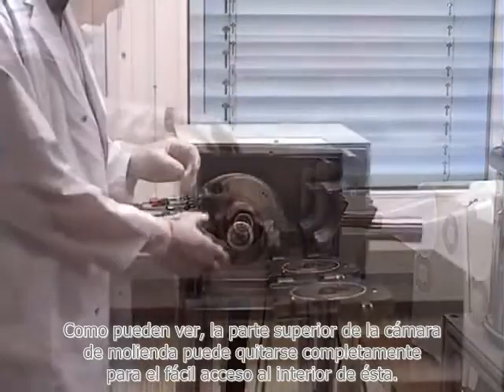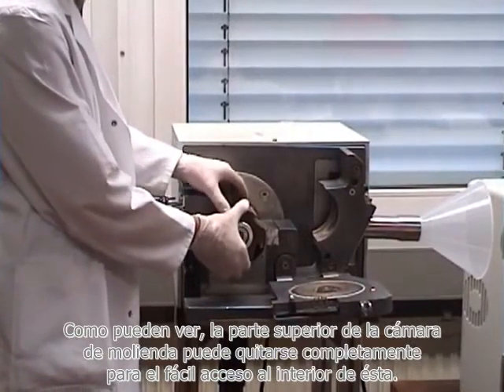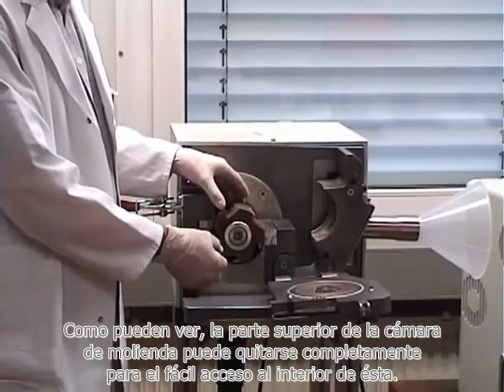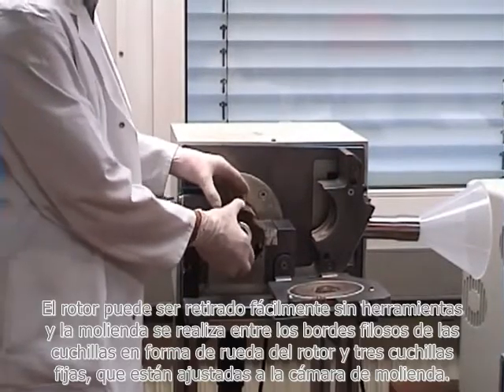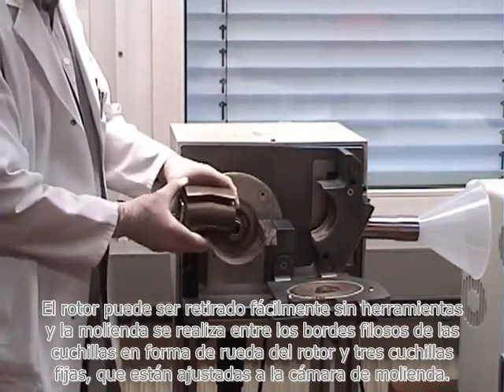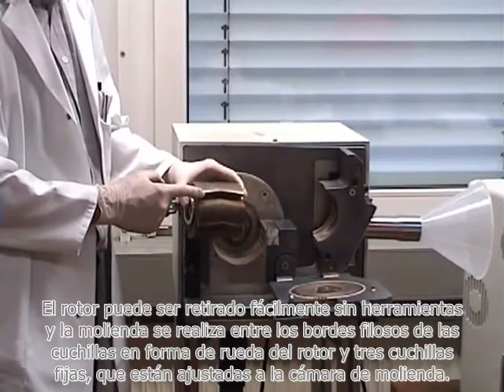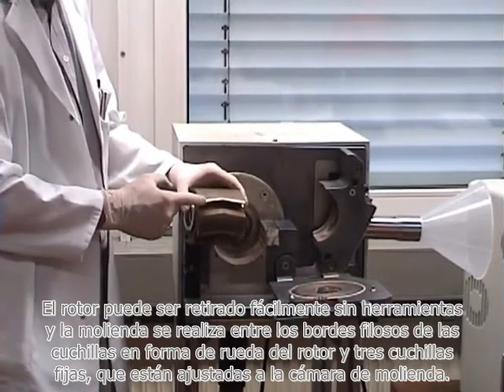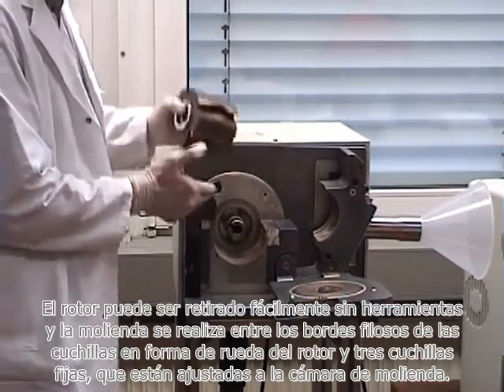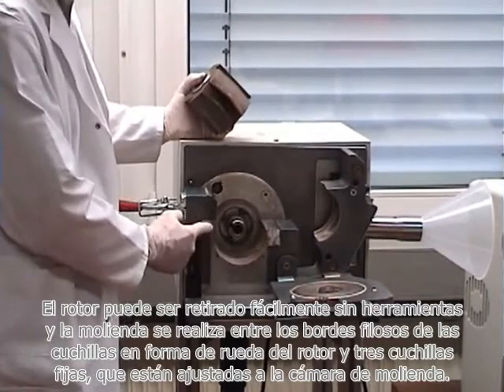As you can see, the upper part of the milling chamber can be completely shifted open for easy access to the inside of the milling chamber. The rotor can be easily taken out without any tools, and the milling is made between the sharp edges of the V-shaped rotor knives and three fixed knives which are fixed to the milling chamber.